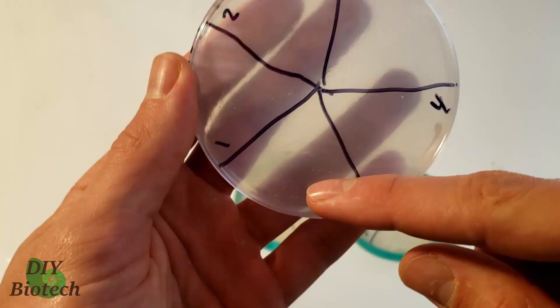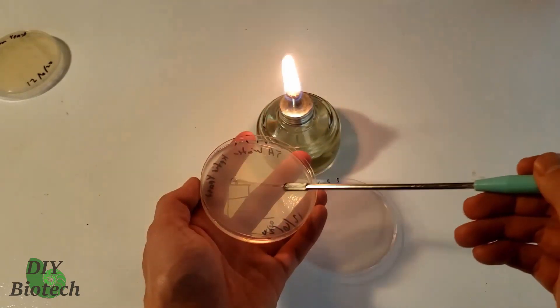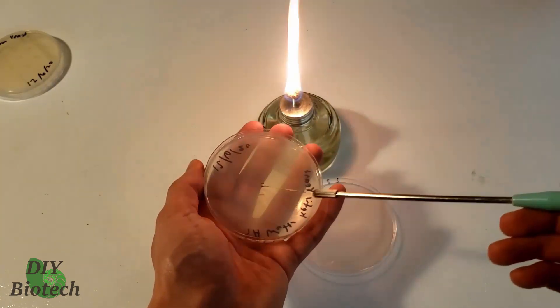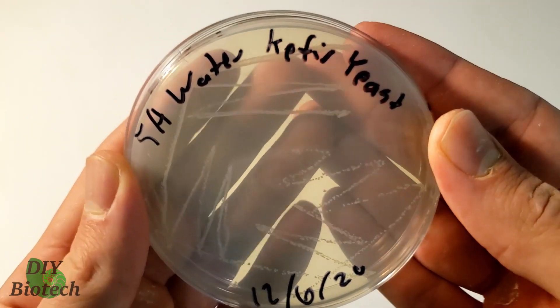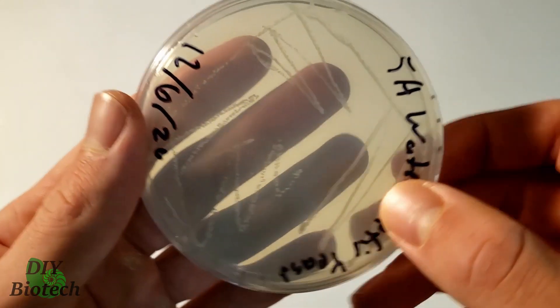After spreading it on the agar petri dish, I let it grow at 30 degrees Celsius in my refrigerator turned into an incubator for about two days. There were a few other organisms growing on the petri dish, so I re-streaked on a new agar plate — touching colonies from the previous plate and doing a zigzag pattern, rotating the plate and repeating. After a few days of re-streaking, I had beautiful small white colonies. This petri dish contained an antibiotic, so there was very little chance these were bacteria. Additionally, the yeast had a relatively slow growth rate compared to bacteria, providing more evidence that it's yeast.